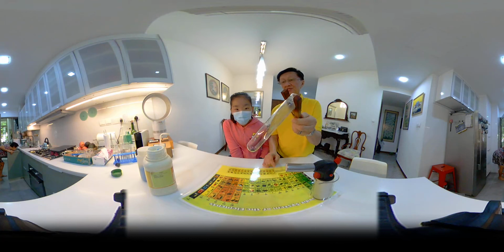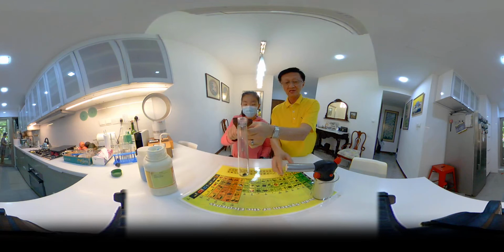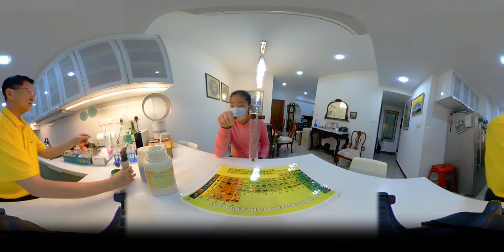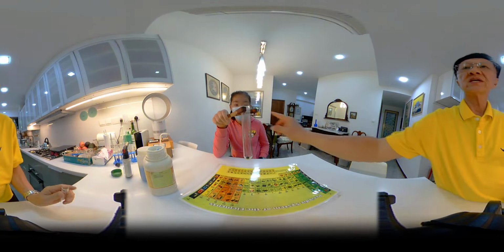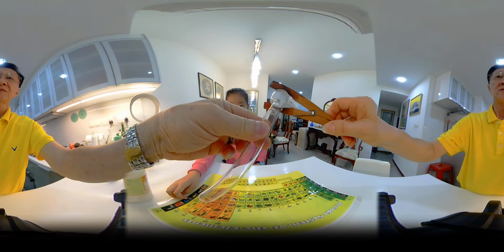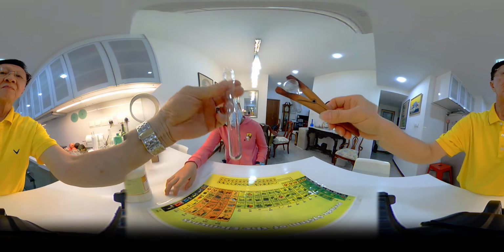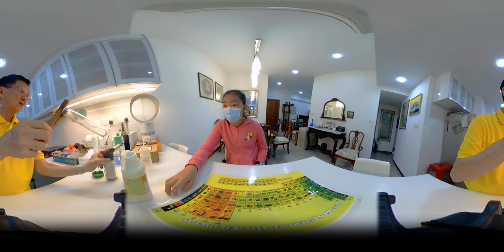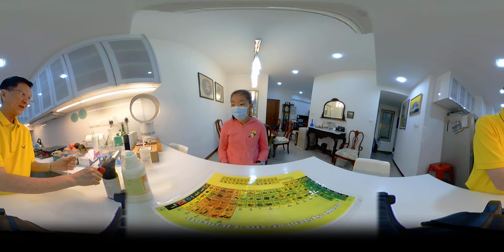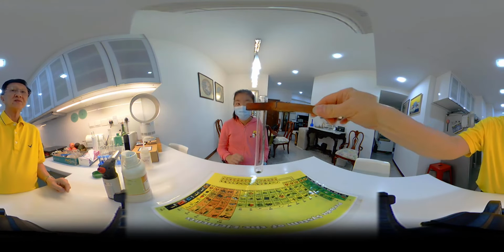So what I'm going to do is, because this is hot, I cannot put acid in the hole. The hole is hot. And I'm going to pour this inside here. Okay. So I pour it inside here. And let's see what happens when I dissolve this in sulfuric acid. Okay, hold.